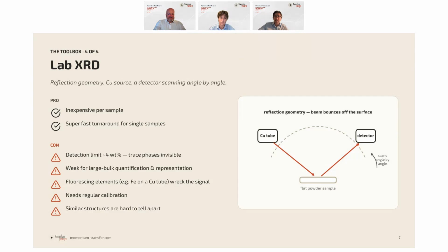It is perhaps a little challenging when it comes to a certain aspect. Detection limits are one of the most difficult ones. You do have very solid detection limits, depending, of course, on your mineralogy very strongly.